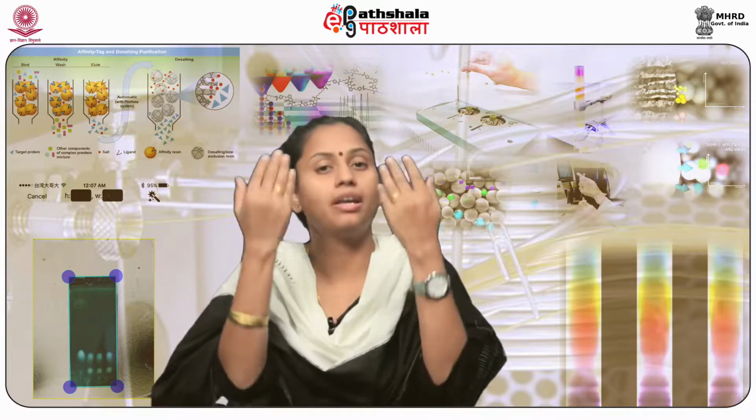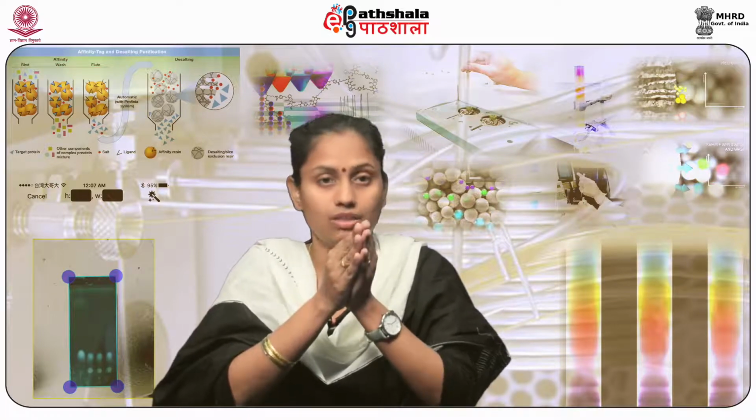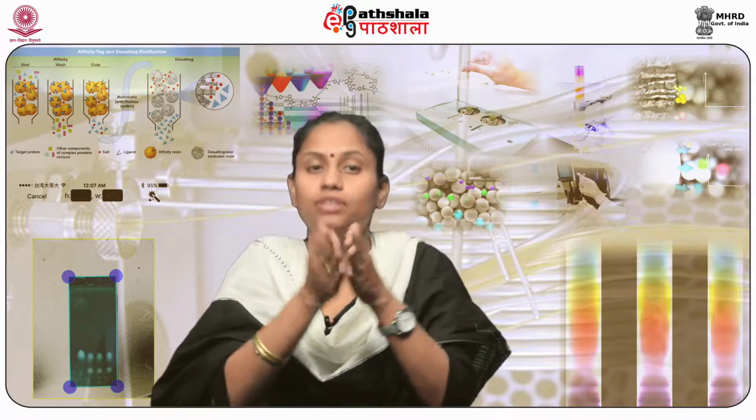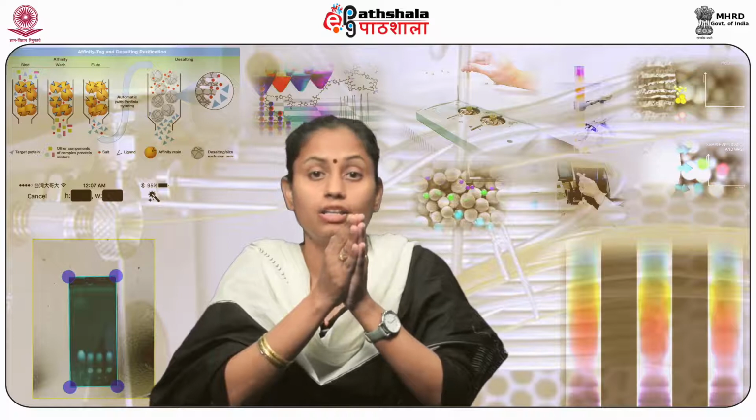The higher the net charge of the molecule, the higher the ionic strength required, as discussed earlier. Therefore, by controlling changes in ionic strength using different forms of gradient, molecules such as proteins are eluted differentially in a purified and concentrated form.